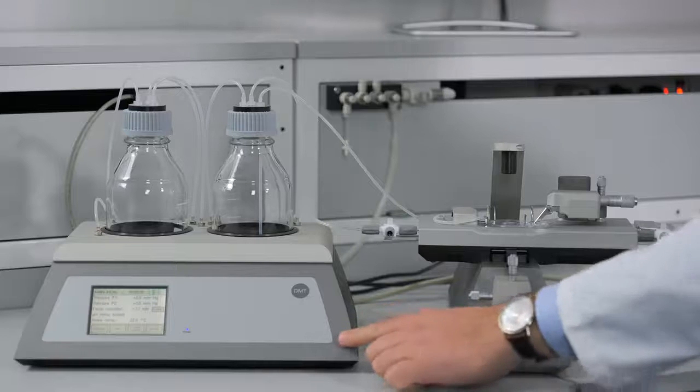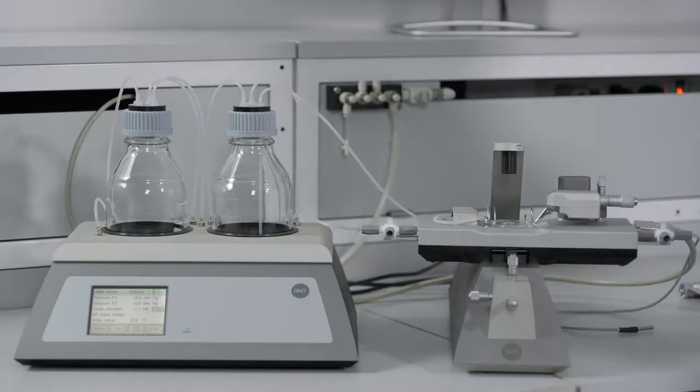The interface is what actually drives pressure and flow through your chamber. It collects data and sends that data to the MyoView software.